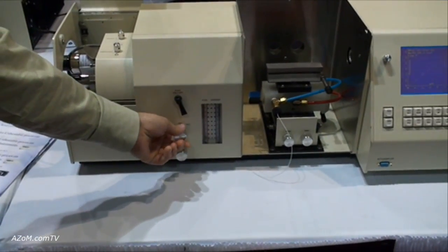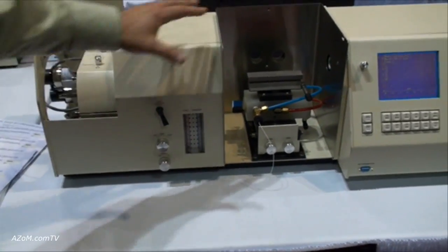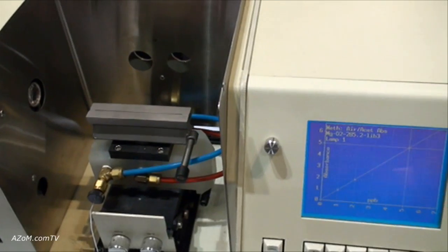It has manual controls of air and fuel ratios. This is our air acetylene flame, which can be switched out for a nitrous acetylene flame.